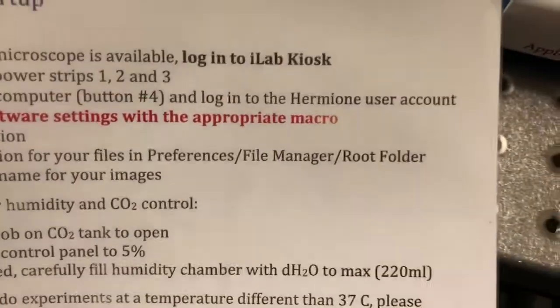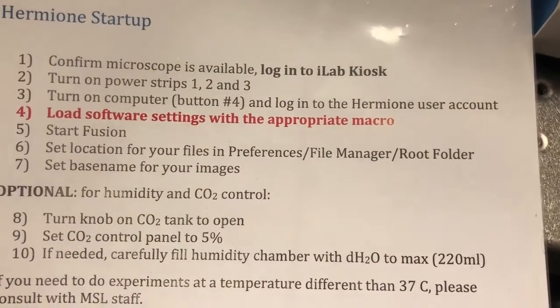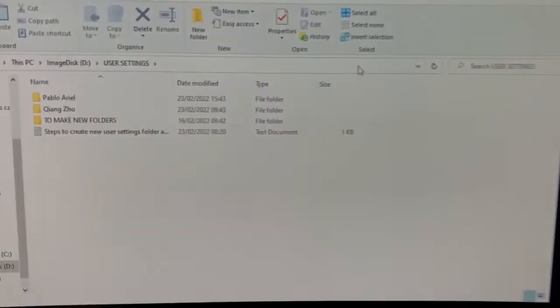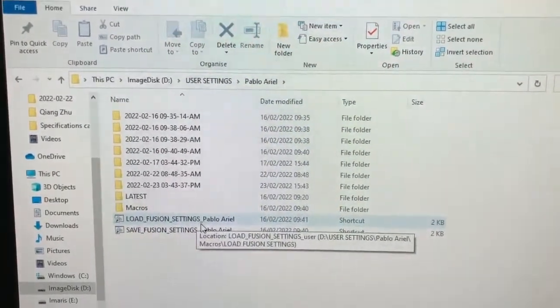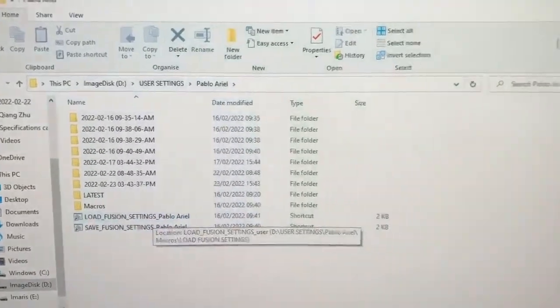The next step is to load software settings with the appropriate macro. This software has very poor management of settings, so you will either need to load generic settings by double-clicking on the Load Fusion Settings button, or user-specific settings from your folder — in which case you would run the Load Fusion Settings macro from there. Today I am going to load generic settings by double-clicking on this link here.